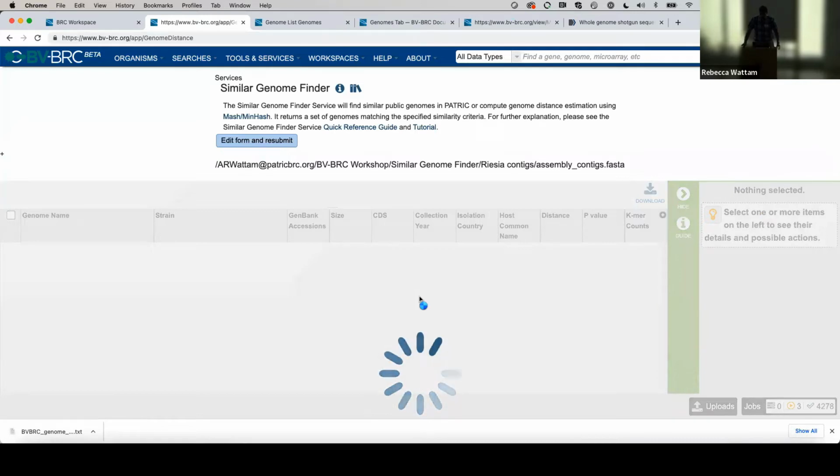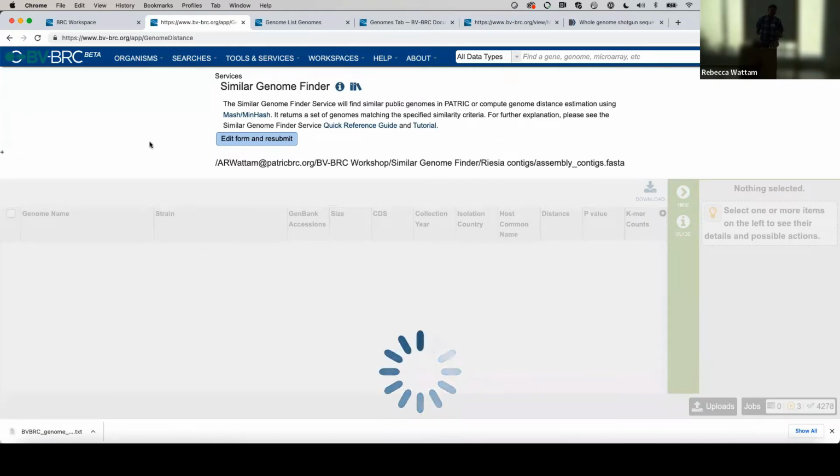This is an example of a job that doesn't take you to the jobs result page. It just formats the results in real time, semi-real time, onto your browser right away. Well, I just ran it earlier and it went really quickly.